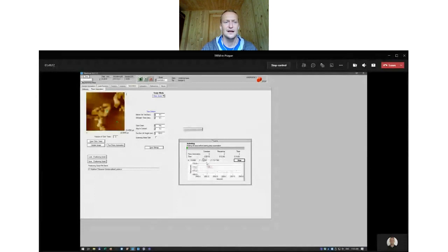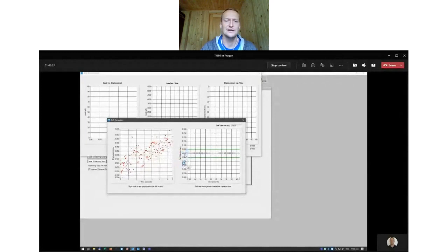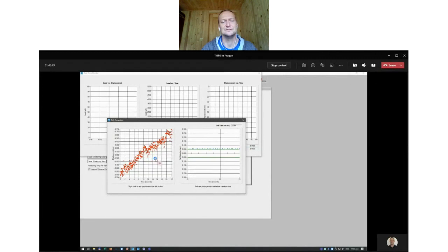and there are some settling times to achieve thermal equilibrium and reduce the thermal drifts. But for now, I'm going to skip those settling times and just move on to indentation. We measure drift before each indentation, so we measure a drift rate. Ideally, the drift rate is 0.05 nanometers per second, which means that our test will be done in 12 seconds. So if we reach this ideal drift rate, then the error in the depth will be only 0.5 nanometers.